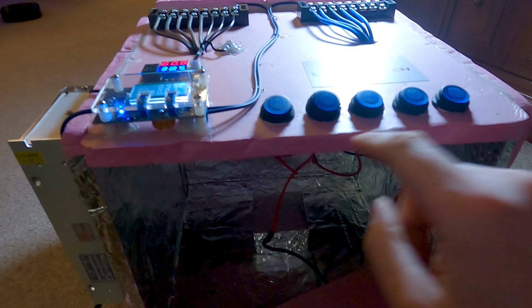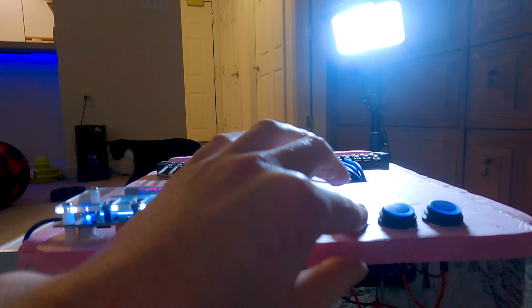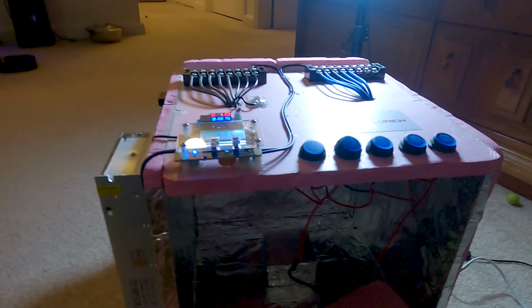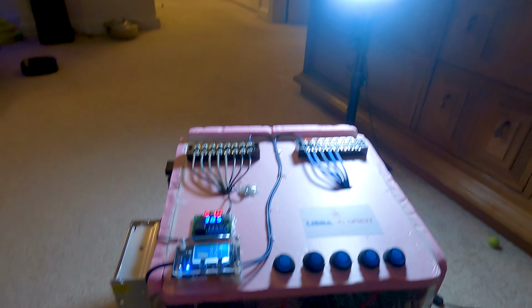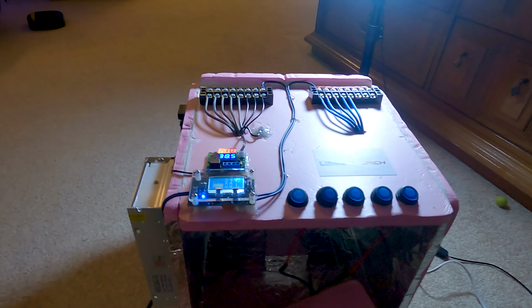310 will be here, and then 365. So there's that right there. That's one of the TLC viewers. And then 395, and that one's obviously a lot more visible. So after a little bit of cleanup work in the 310s, she'll be set to go. Then some hinges for the door, obviously. We'll be good to go.